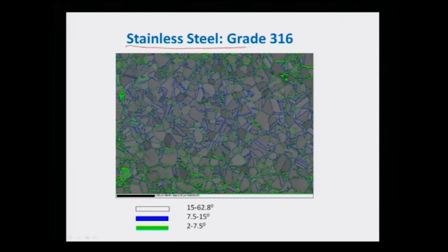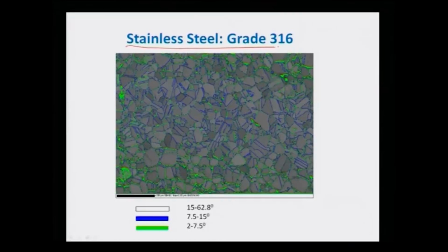Well, so now I am going to show you different pictures and different analyses which we did while giving you the demo in front of the SEM in the Department of Materials Science and Engineering at IIT Kanpur. Here we are looking at another sample of stainless steel, austenitic stainless steel 316, which, as you know, has an FCC crystal structure containing about 18% chromium and 8% nickel, and one can take the sample and analyze the grains, grain boundaries, misorientations and many other features.